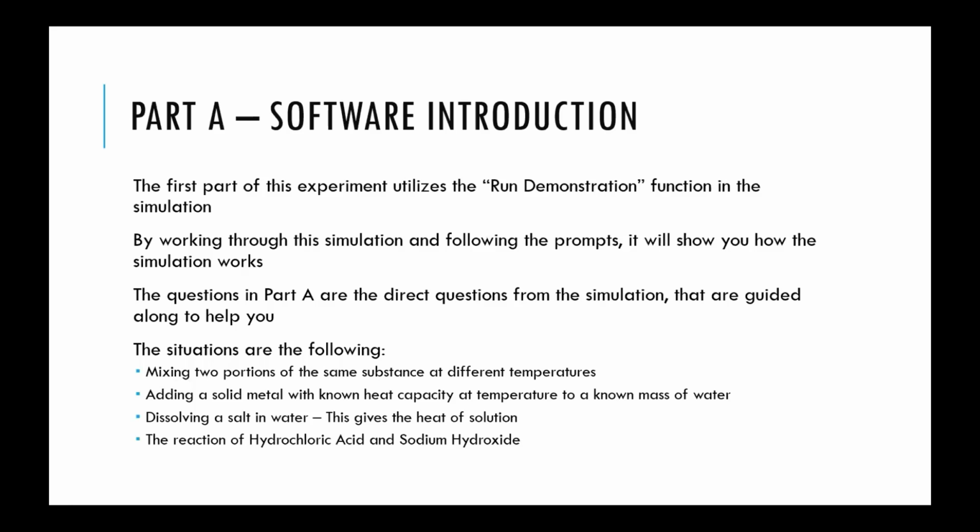Where is energy going from one side to the other? You're also going to add a solid metal with a known heat capacity and a specific temperature to a different mass of water. This is transferring heat and getting you used to using the enthalpy calculation.